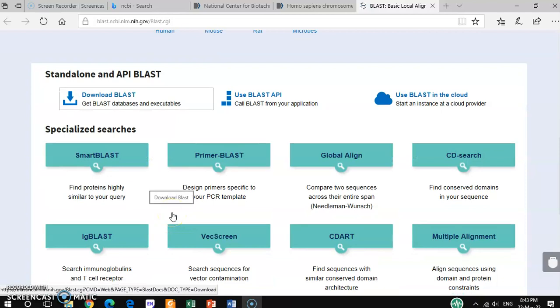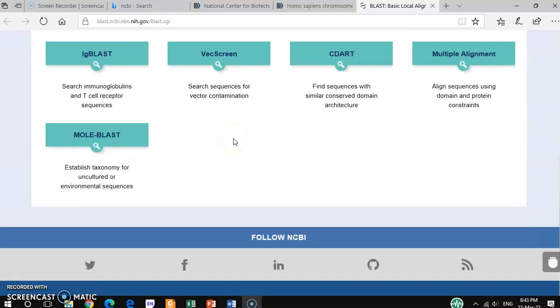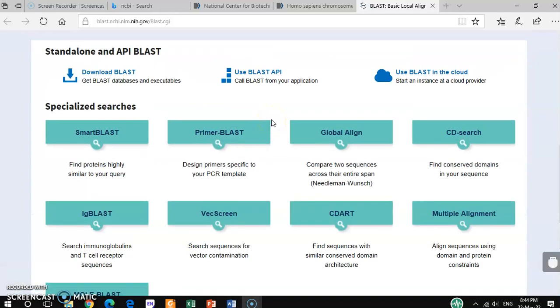In this tutorial video I'll show you how to design primers using NCBI. I already showed in several previous videos how to make any kind of primer using Xgene, and that was manual. I also showed one video on how to do it using one online tool. But this is NCBI BLAST, how to get and design primers very accurately.